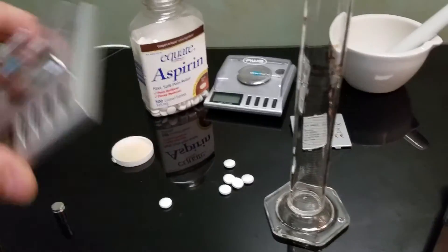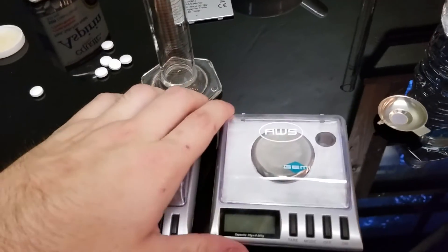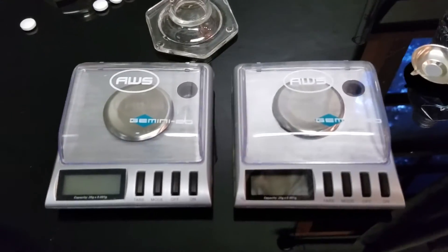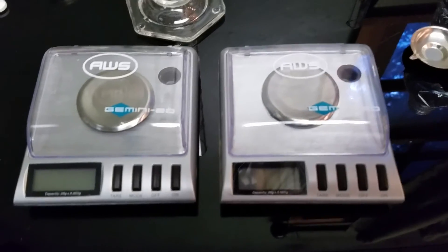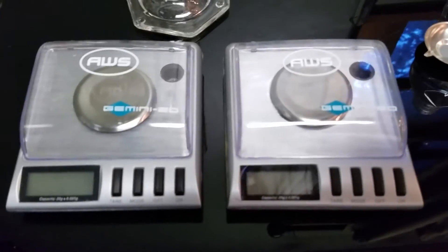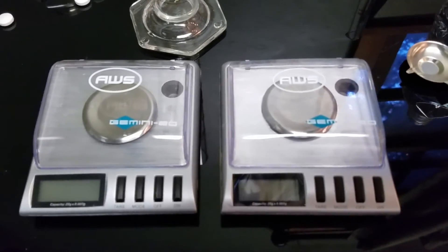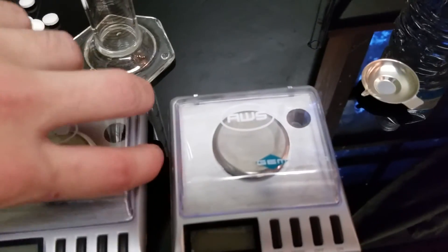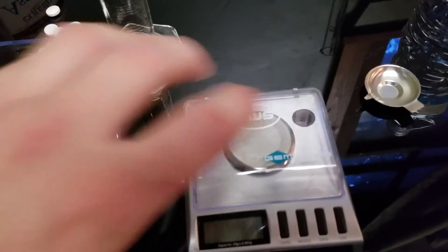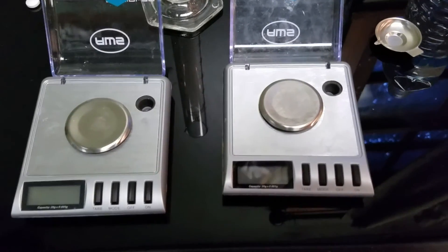In conclusion, pay the extra 30 bucks, 60 bucks, whatever it is for a real lab scale. Going to your local head shop and buying a scale and then using it for a supplement that needs to be accurate to 5 milligrams is just stupid. You shouldn't be using this and putting your life on the line for a scale that can't even weigh its own calibration weights. So get rid of them, throw them away, go buy a real scale — not these pieces of crap.